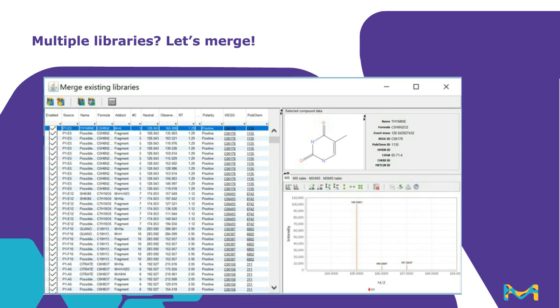Upon closing the discovery program, the entire project will be saved, as well as all of your raw data files, your project preferences, and any exported libraries that you've created. These will all be available in the home project directory and can be reopened at any time.